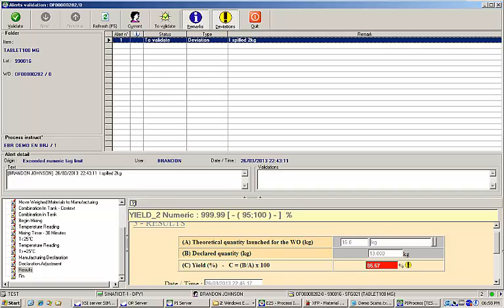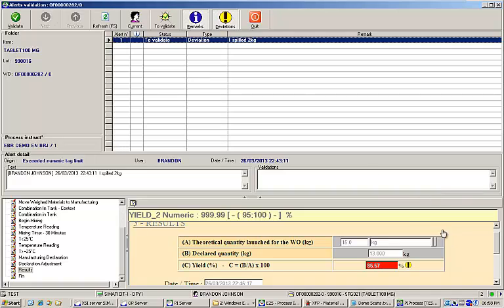It is also possible to view and print the fully executed batch record, but since the MES is fully 21 CFR 11 compliant, there is no need to retain paper copies of your batch records. Everything is stored securely in the database and can be reviewed at any time. Data archiving features allow you to keep executed electronic copies of your EBRs for as long as necessary.